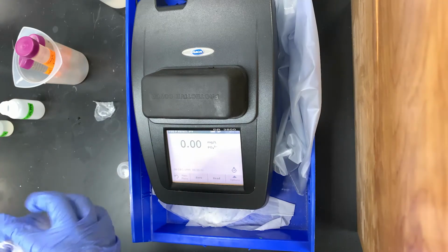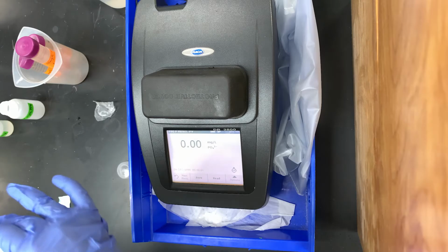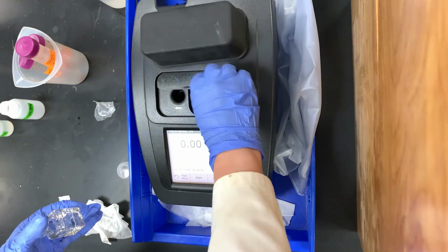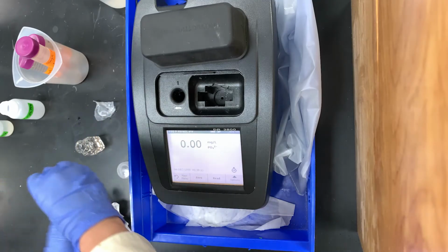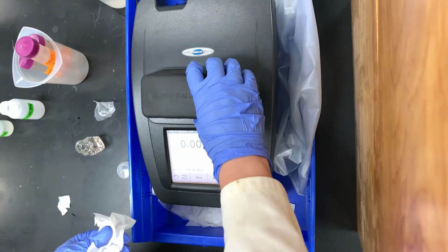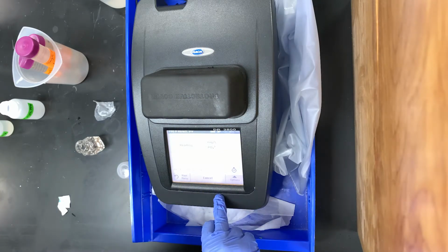The blank is already inside, so we'll just go ahead and zero for that. Again, no dilution was used for the sample, and the blank is just 10 mils of the sample with no reagent added. So again, we'll give our cuvette a wipe down with a chem wipe, place it inside, and just press read.